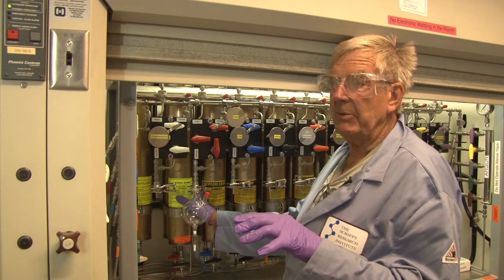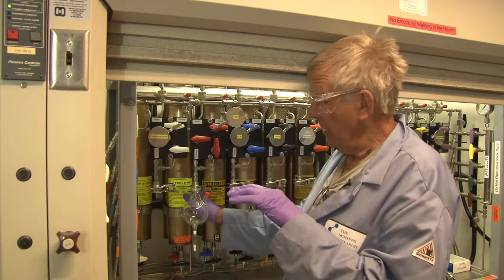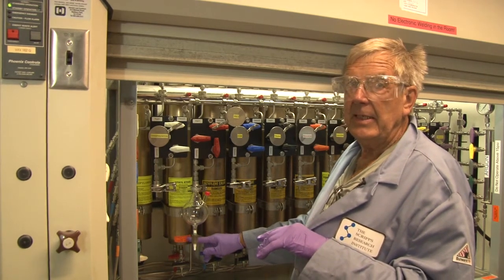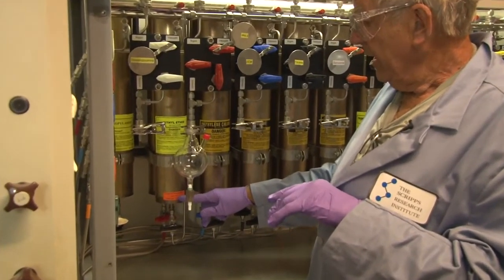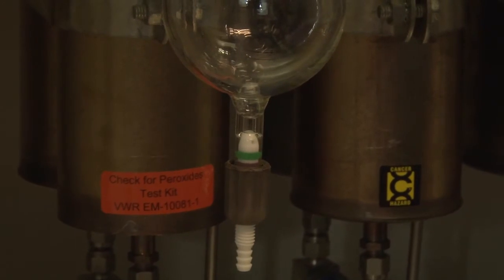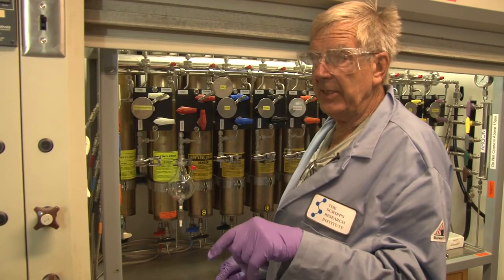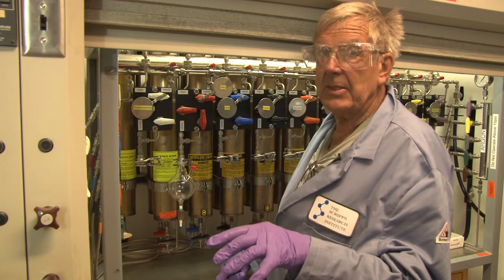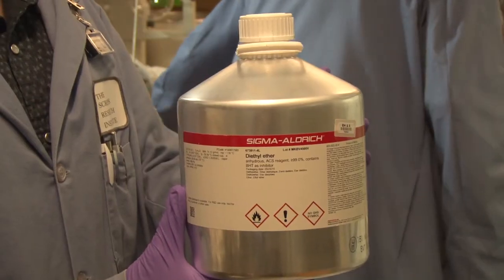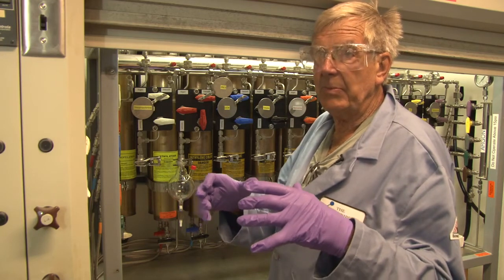Peroxides do not really become an issue until somewhere around 100 ppm, but they are stored in the columns. On the bottom of the column there is a label that gives you a number for a peroxide test kit. Every other refill, you should check what comes out of the column and what you are putting into the tanks. Ether should only be used out of a sealed aluminum can, not drums — ether drums are cheaper but they leak, you can always smell them. One-gallon aluminum cans is the only way to go.